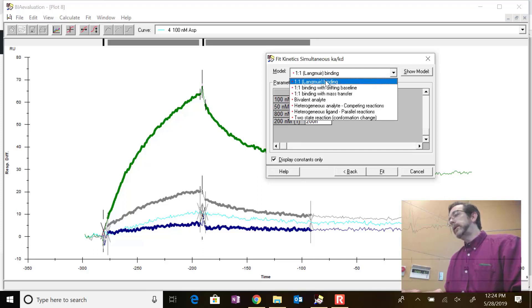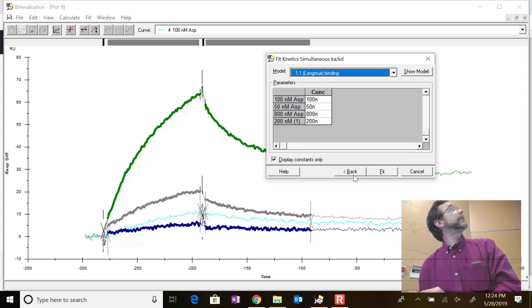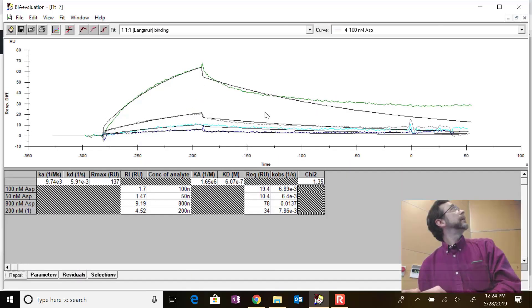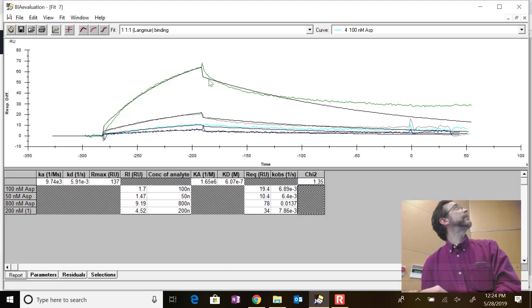Then you select the model. For us, we select the simplest kinetic model, which is one-to-one Langmuir binding, and double-check that all concentrations match what they should be. Click OK. Looking at the result, we're not fitting this irreversible end portion, but I didn't tell it to look there so I'm not worried. The fit could possibly be better here but I think it's fine. You look at how closely the black line approximates the colored lines - you actually have a pretty close approximation for the three lowest concentrations.